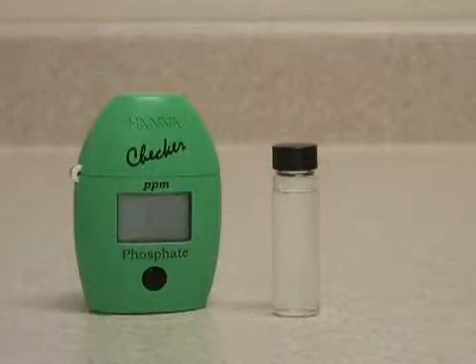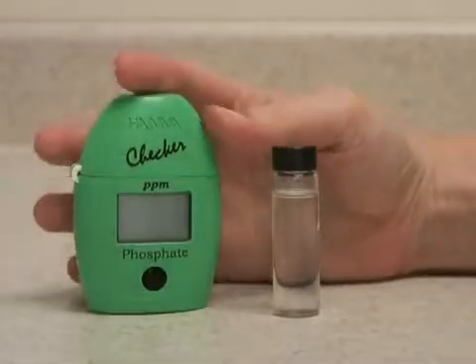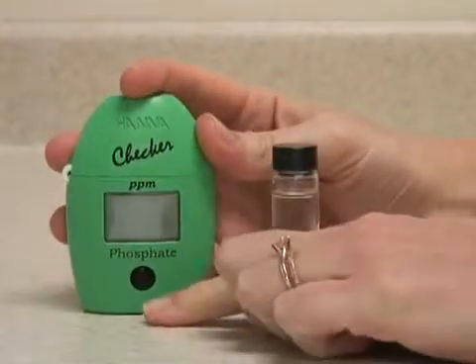This is the Hanna Instruments Checker HC Meter for Phosphate. This meter is very easy to use. To operate, it's a single push button.